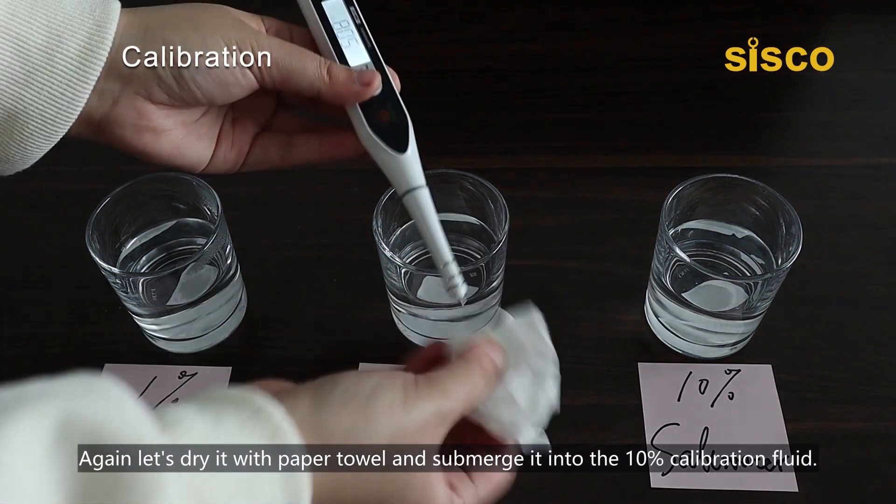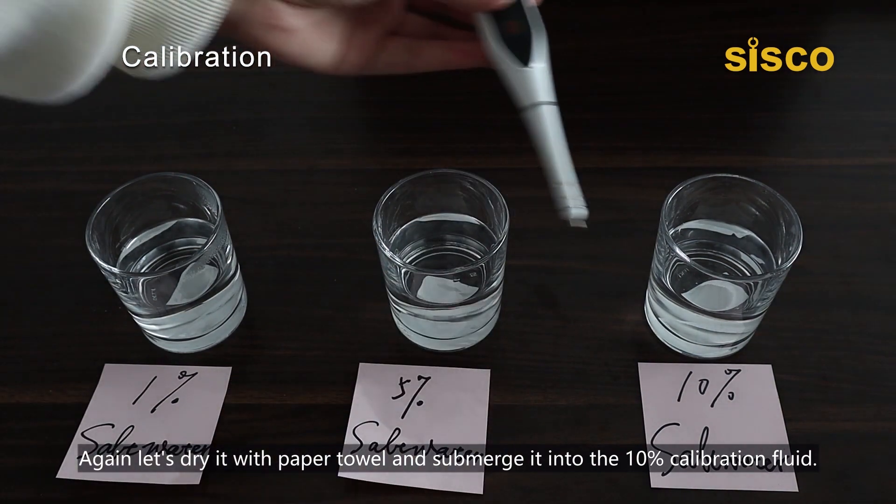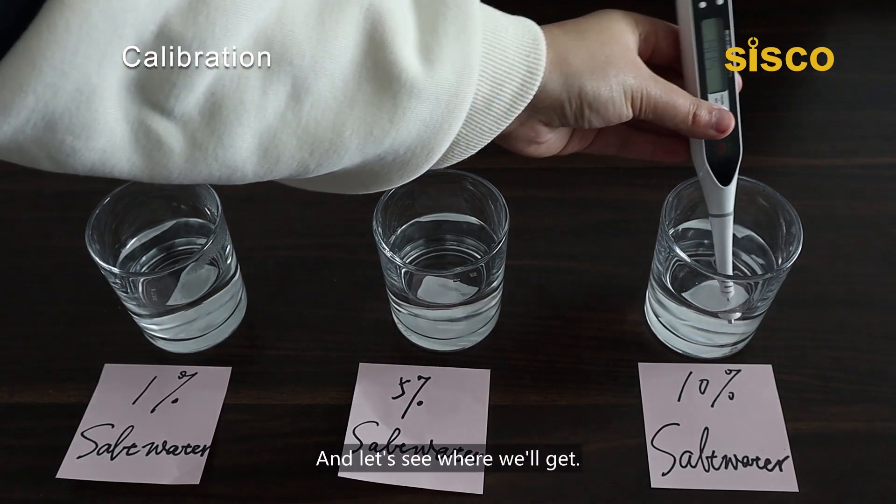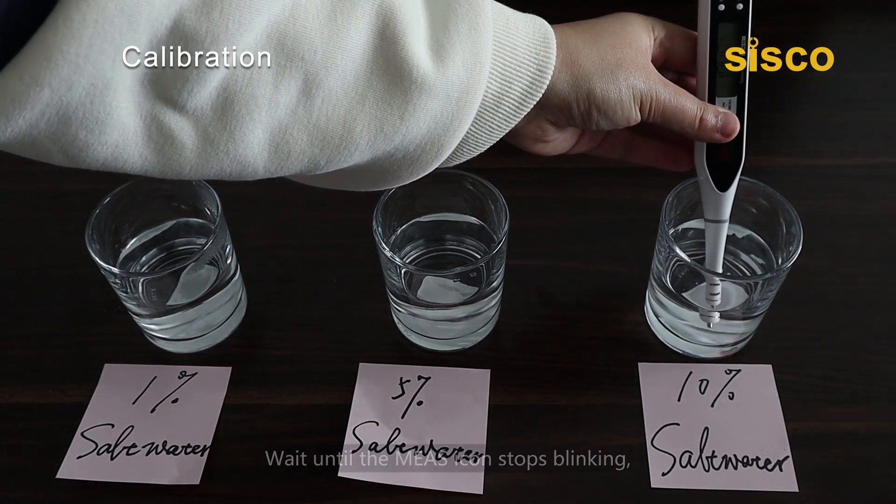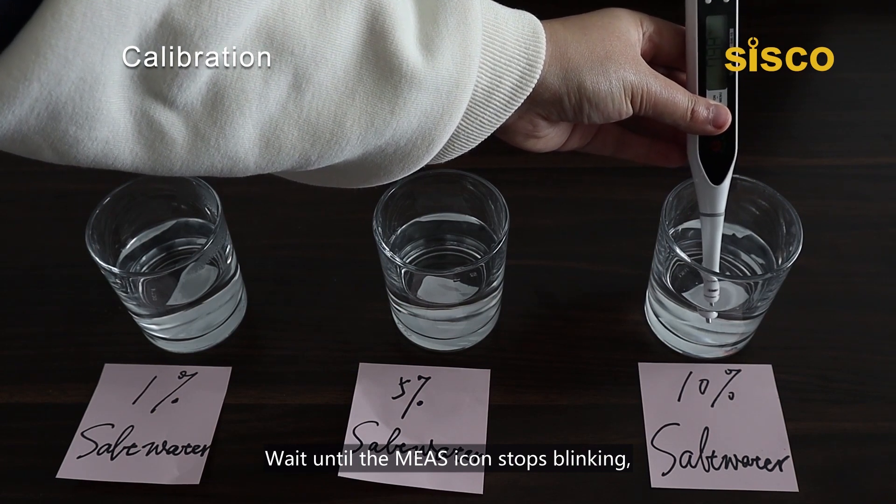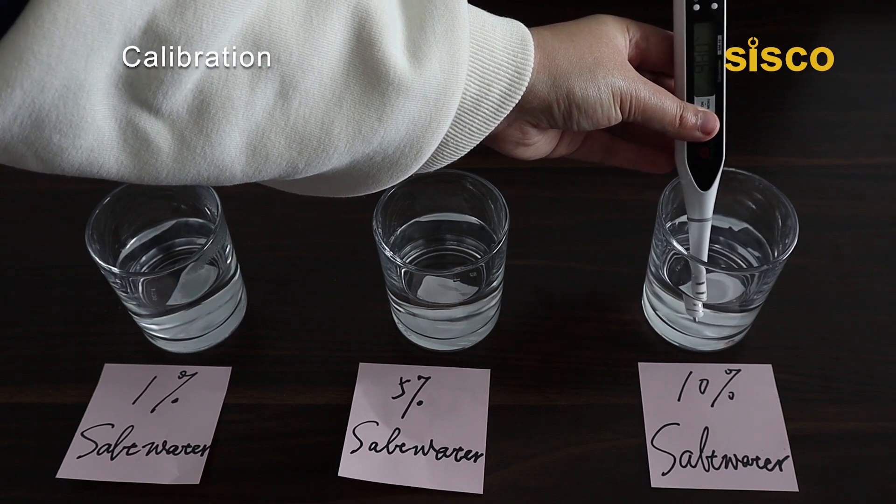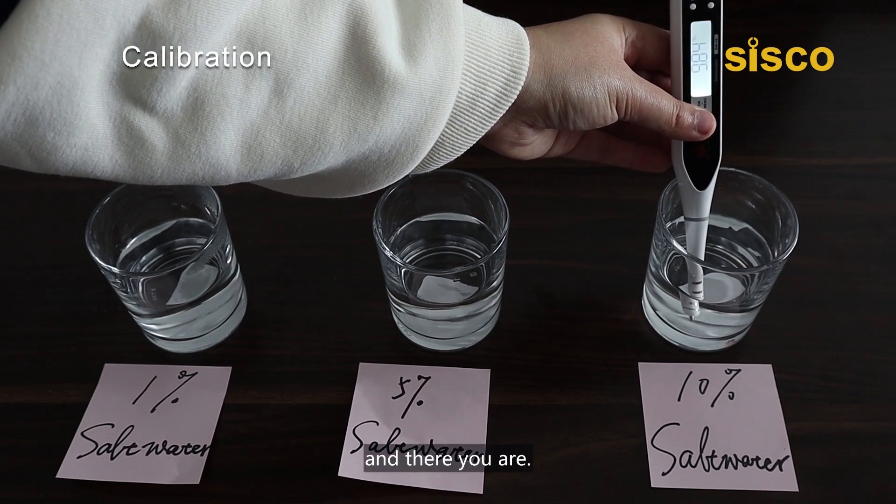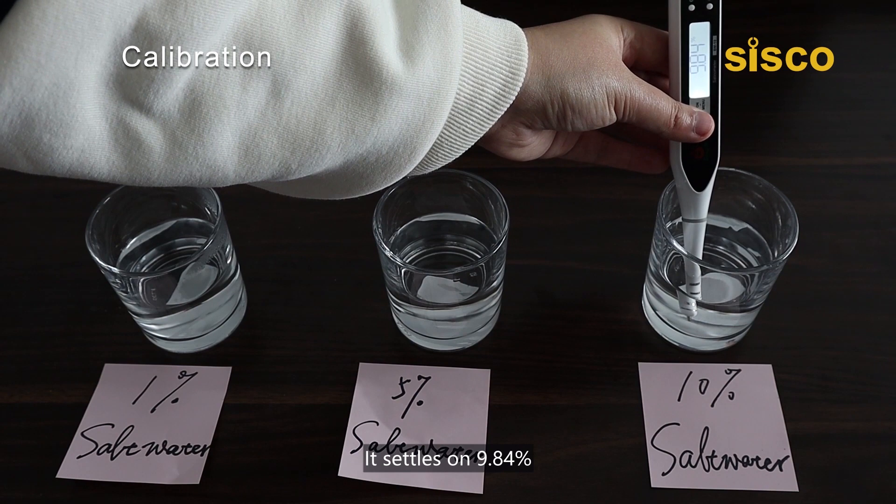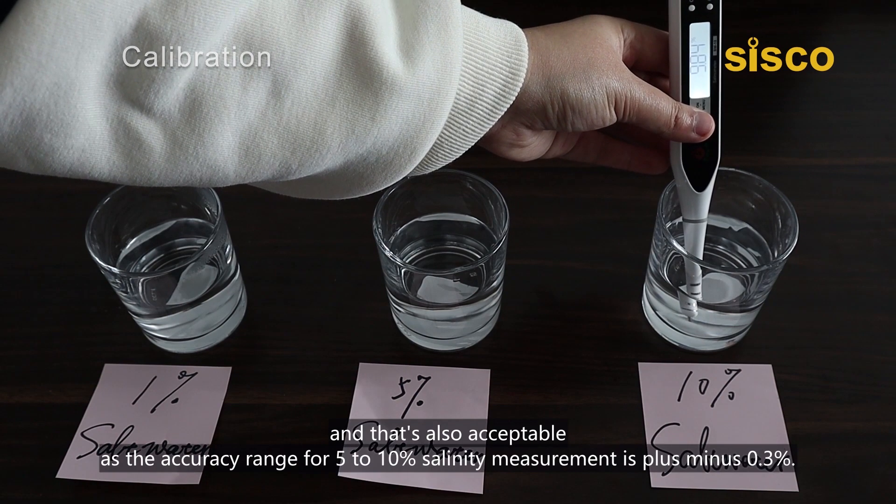Again, let's wipe it with paper towel and submerge it into the 10% calibration fluid, and let's see what we'll get. Wait until the MEAS icon stops blinking. And there you are. It settles on 9.84%, and that's also acceptable, as the accuracy range for 5-10% salinity measurement is ±0.3%.